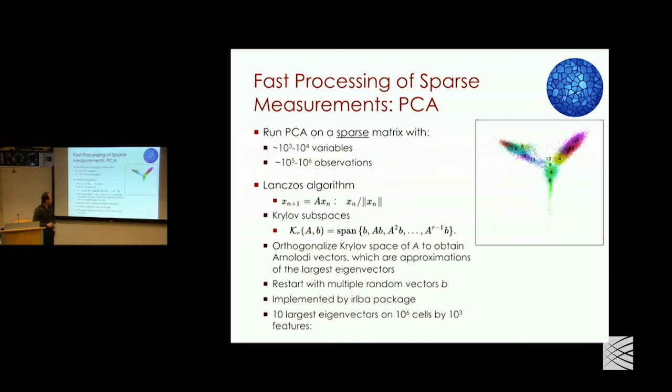In terms of the need for the eigenvectors, it varies. Again, it depends on the level of detail you want. Usually after 20 or so, you start repeating, getting things that are not really making a difference to the final result, at least as far as clustering is concerned.